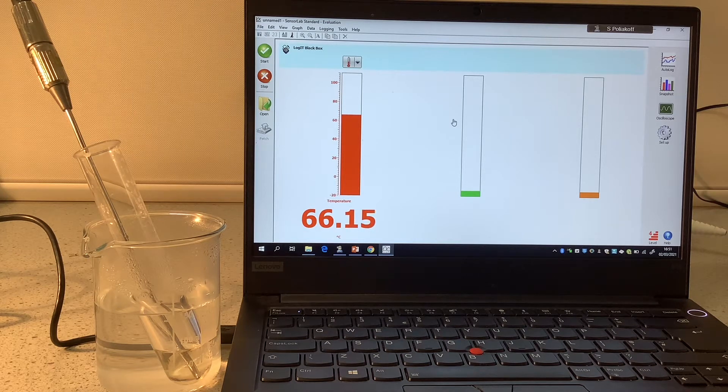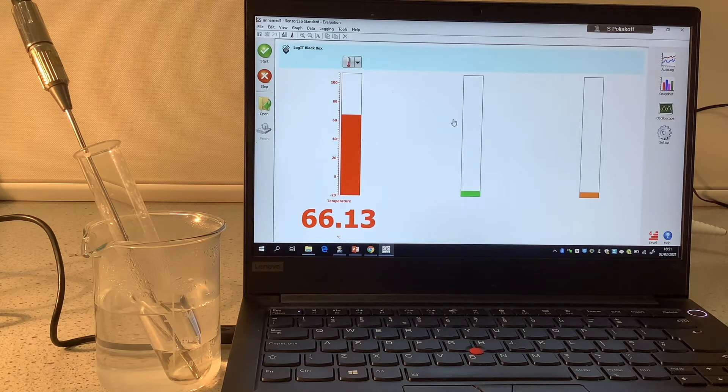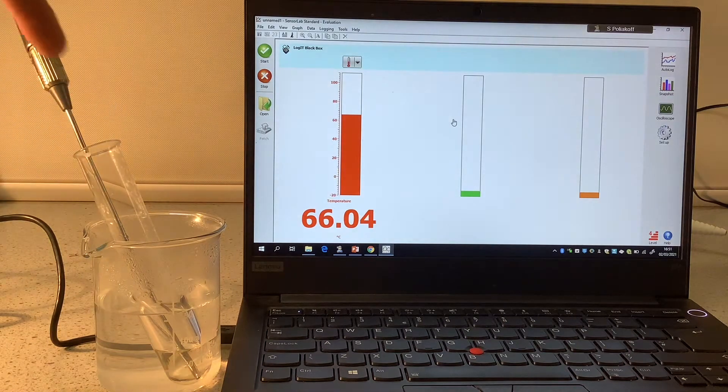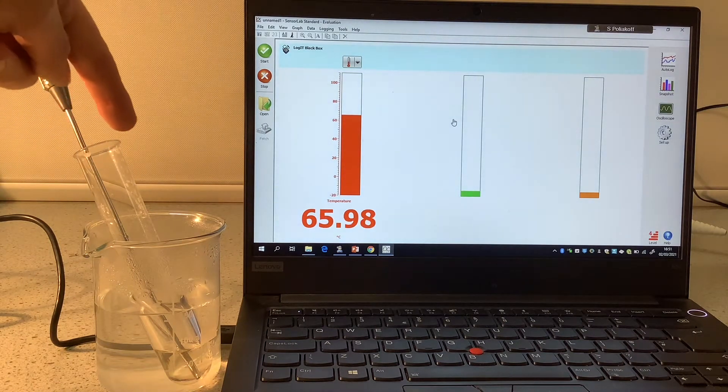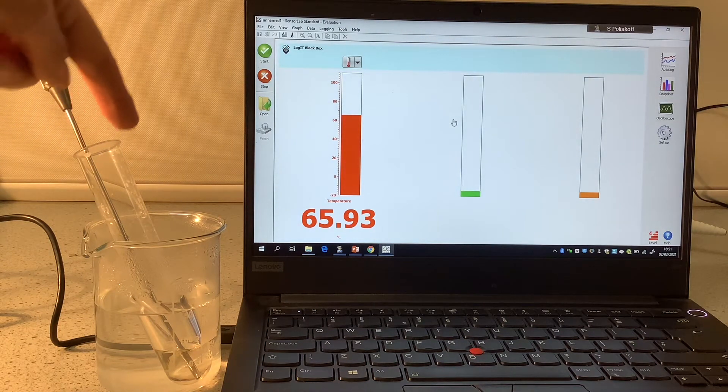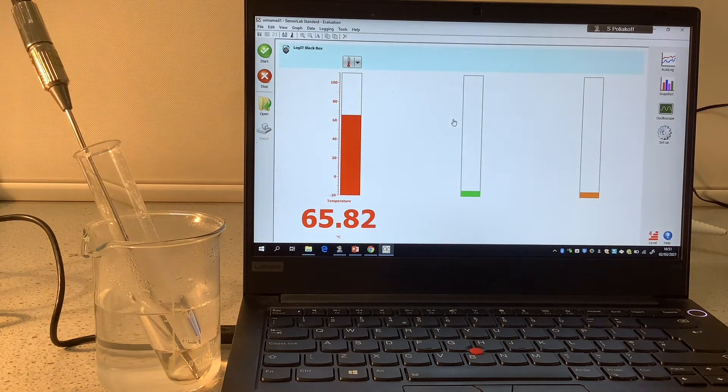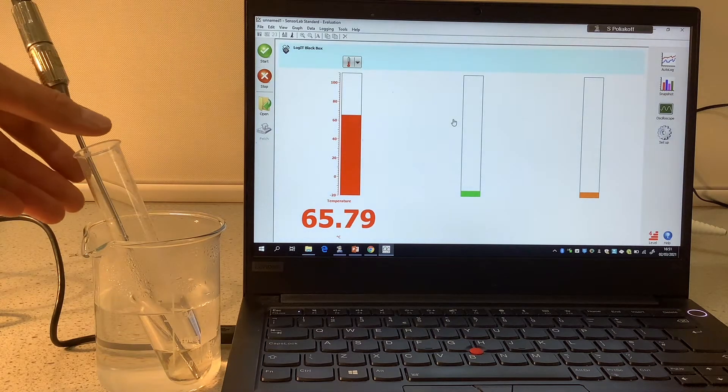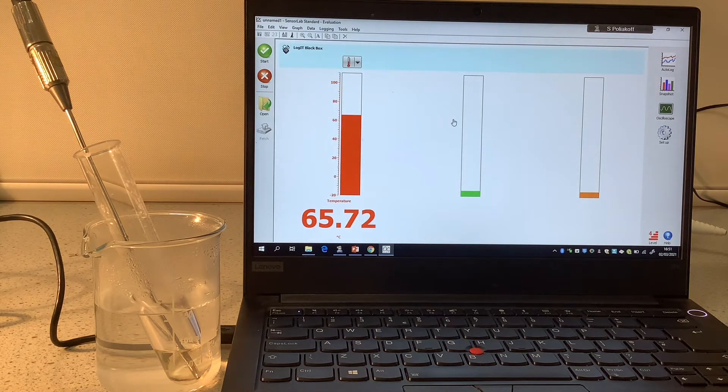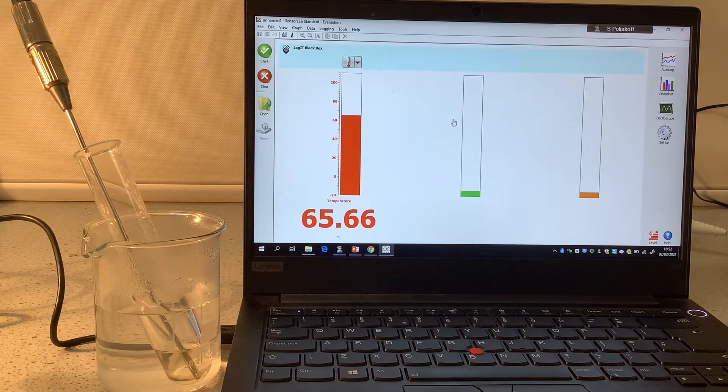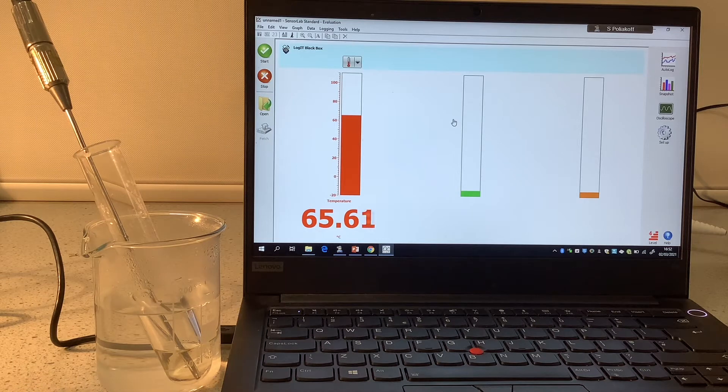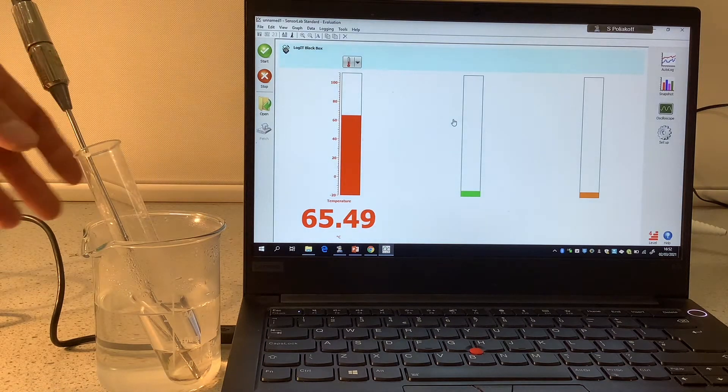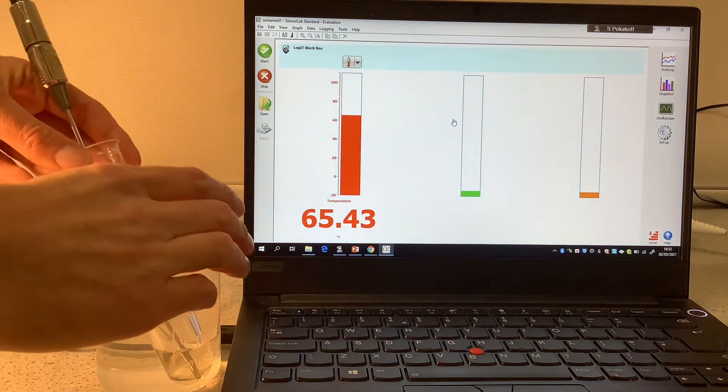And what I'm going to do in a moment is I'm going to take it out of the water and pop it into another beaker which has just got a weight in the bottom to stop it falling over, and then I will start logging the graph.